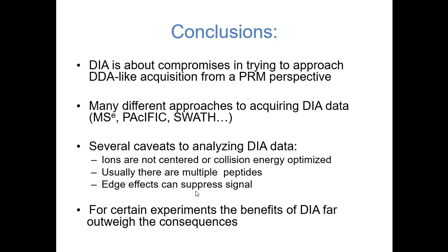And so some people have gone back and forth as to whether iTRAQ or TMT is better than DIA. There was a presentation at ASMS by Lukas Reiter about this idea, comparing the two. But I think that's sort of a reasonable landscape. Does that seem like a fair representation?